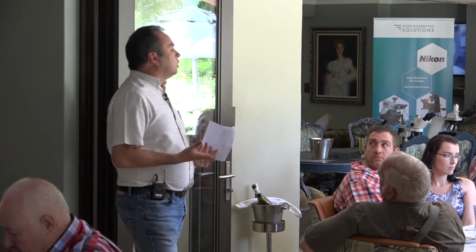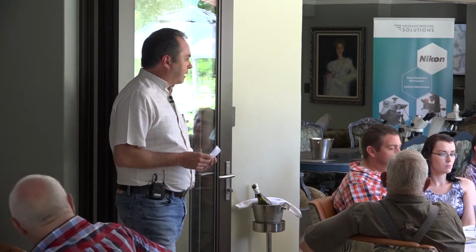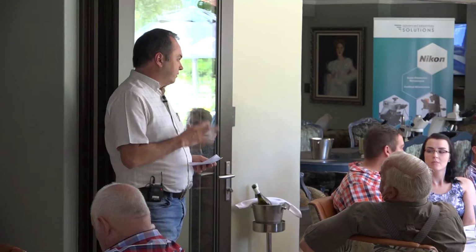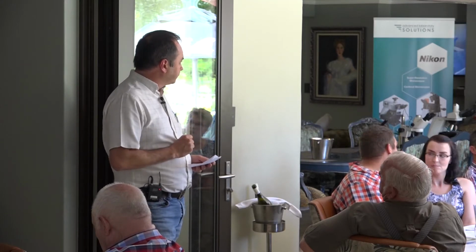You're not going to see more. It all depends what you're looking at as to how much money to spend. But as a rule, looking at your sort of applications here, you should be able to spend less than 10,000 Rand on a microscope, and you'll have a good basic microscope that will allow you to do whatever you need to do.